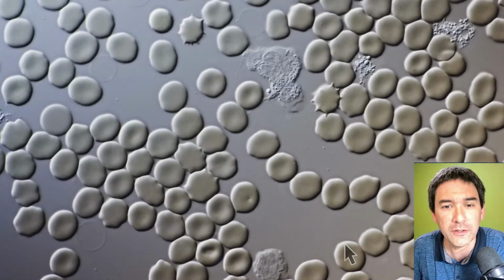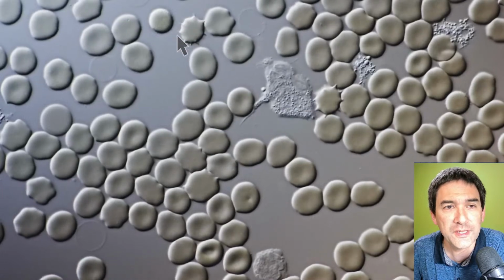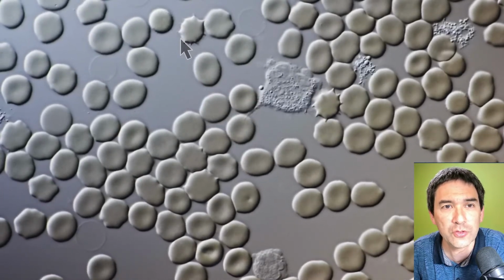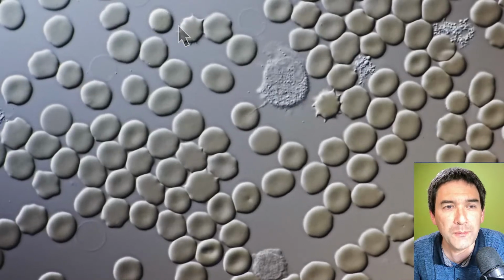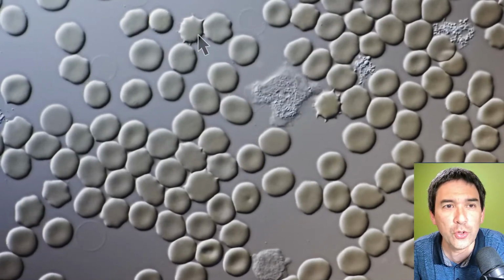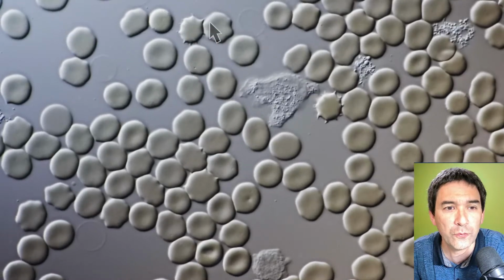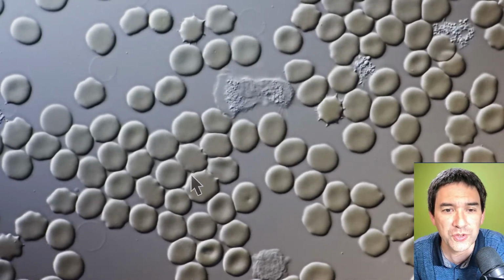Here at the top is one of those cells that I was talking about. This is when the blood starts to dry up. The blood cells lose water, and then the membrane will start to form wrinkles like this. So the longer you wait, more of the cells will start to form these spikes. You see already some of them down here also developing those spikes.